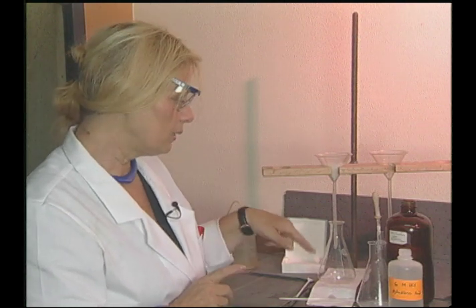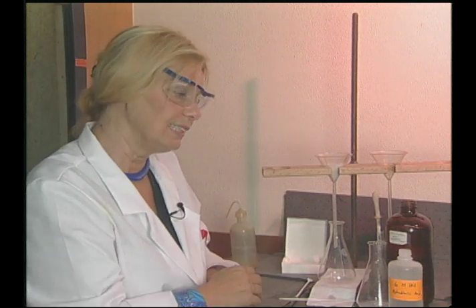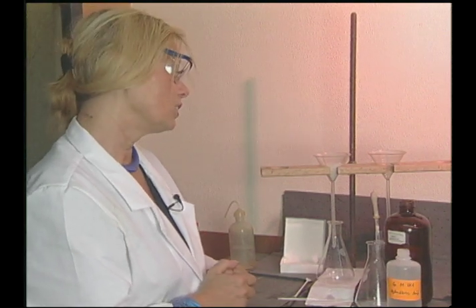The solid will remain behind in the filter paper, and it is called the residue. The clear liquid that comes through is called the filtrate. So the filtrate will contain the nitrate ions coming from the lead nitrate solution and hydrogen ions, or hydronium ions, coming from the acid. The lead combined with the chloride ions to make PbCl2, which is a substance that is not soluble in water. Its solubility is very, very minute. This is, of course, to our benefit, because then we can apply the filtration separation technique.